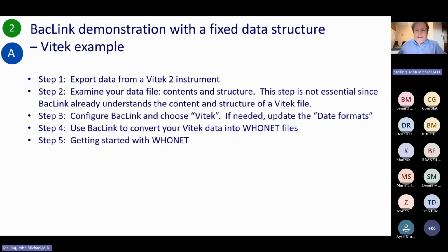But if you have an Excel file, a text file, then yes, it becomes very important to understand how the data are stored and organized. We will then see how to go to BacLink, choose Vitek. If needed, you can update the date formats.